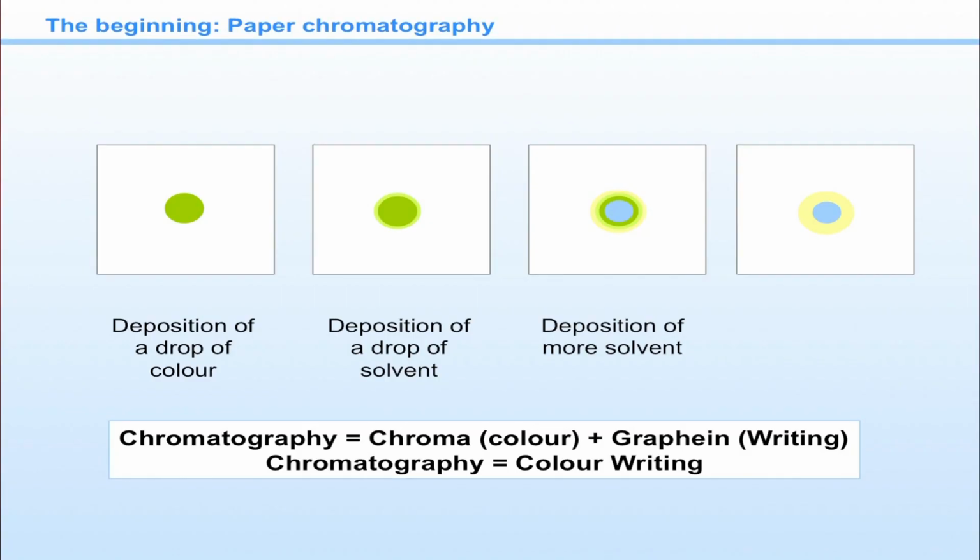Coming to the principle of paper chromatography, for the sample you are going to separate, the principle is based upon the paper partition rather than paper adsorption. Okay. So, since you are going to follow the principle of paper partition, which will be the stationary phase and which will be the mobile phase? You are going to use the Whatman filter paper as your stationary phase.